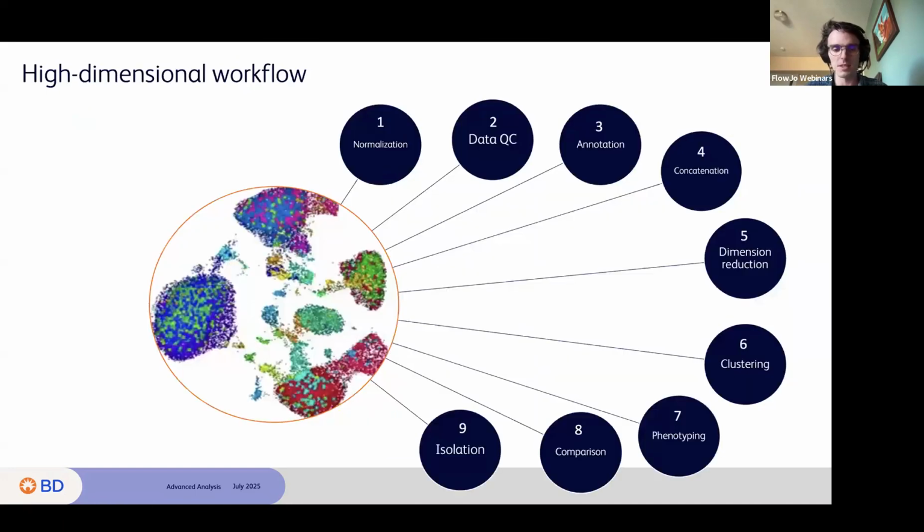we're going to keep moving through these slides. I see a few new people have joined us. Thanks for joining. We're talking about clustering high dimensional analysis today with FlowSOM, T-Rex, and ClusterExplorer. We're going to do some slides quickly and then go to a live demonstration.